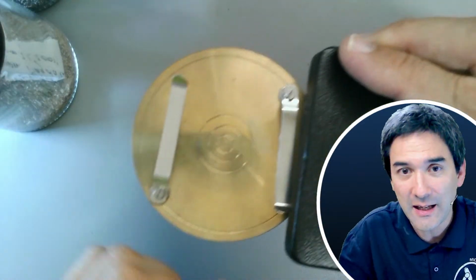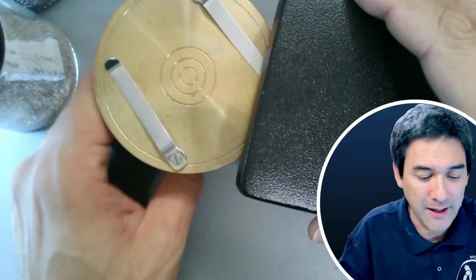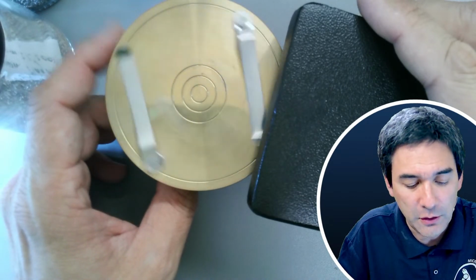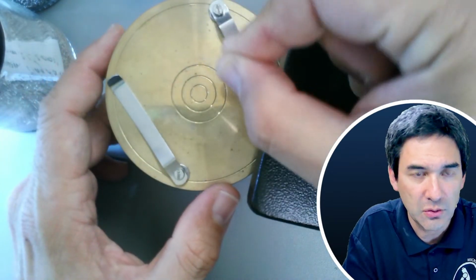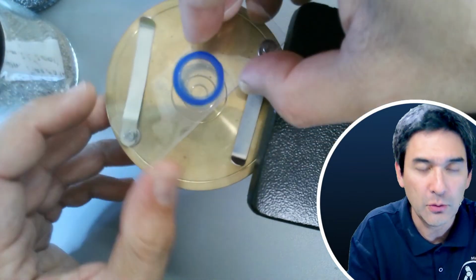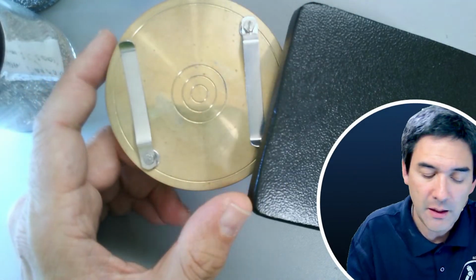I can also use polarized light. I need the filter, which is over there in my drawer, so I'll try this later. And what you do is the following: you put a slide in here, and then you're able to hold a brush here, and as the slide spins, you're able to make those rings here. I'm going to demonstrate this to you. This is quite a nice little thing here.